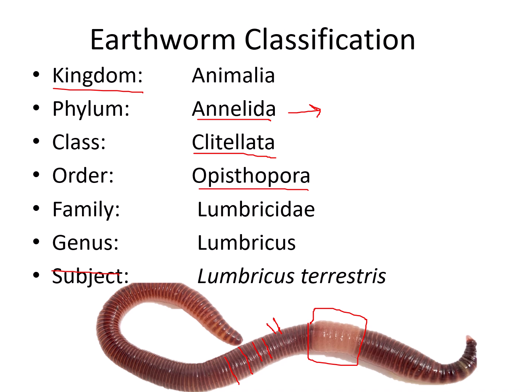So this earthworm that we will dissect is present in the soil, it is present in a terrestrial area.